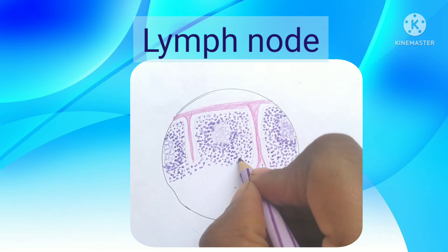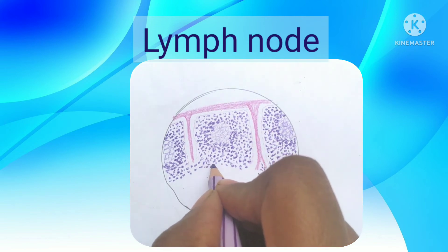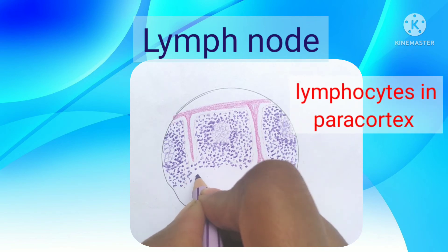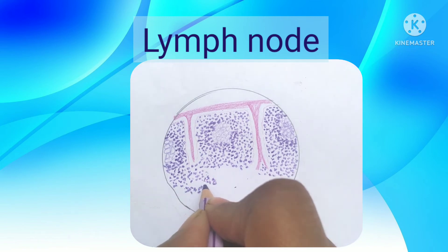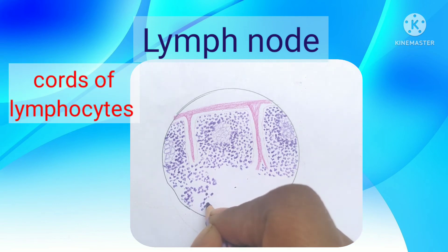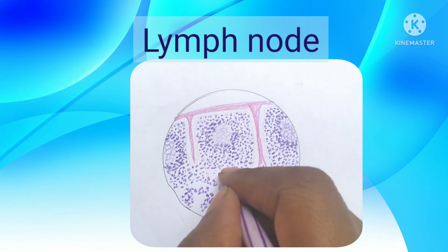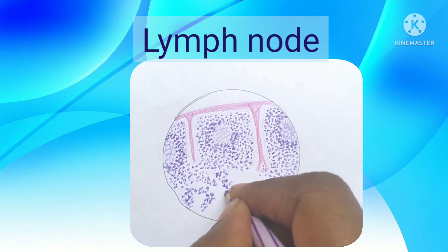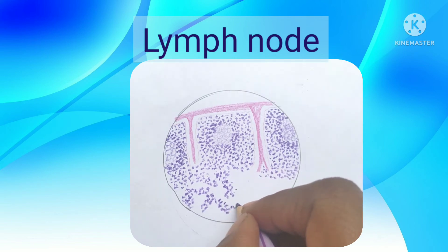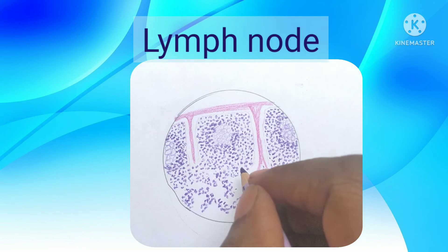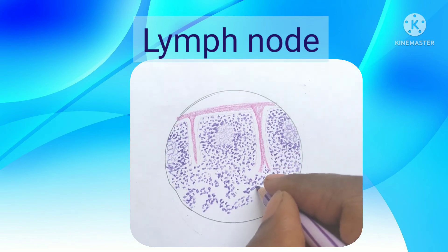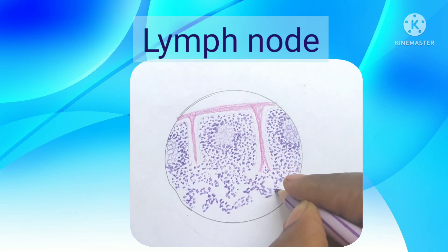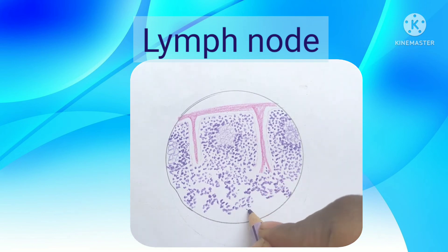Deep to the lymphatic nodules, you have a uniform distribution of lymphocytes - that's called the deep cortex or paracortex. There is no lymphatic nodule in the deep cortex. It is a thymus-dependent area because it contains mainly T-cells. The lymphatic nodules mainly contain B-lymphocytes, plasmablasts. Coming to the medulla, we have cords of lymphocytes mainly consisting of B-lymphocytes, and in between we have sinuses - medullary sinuses - which unite to form the efferent lymphatic vessels.